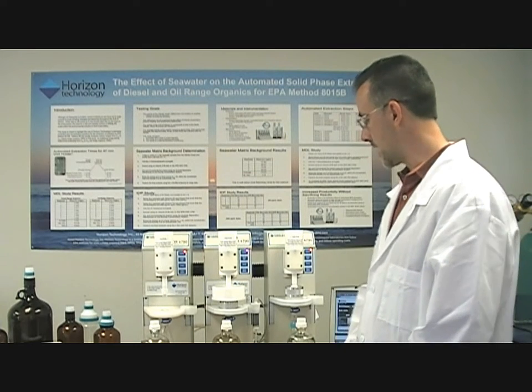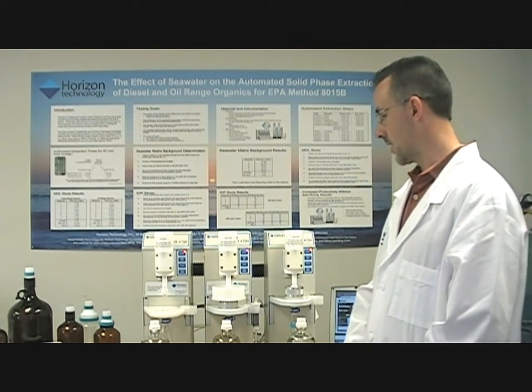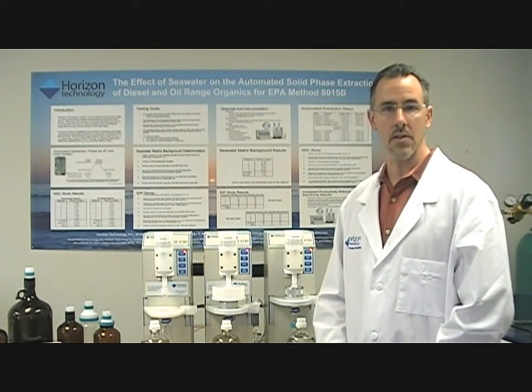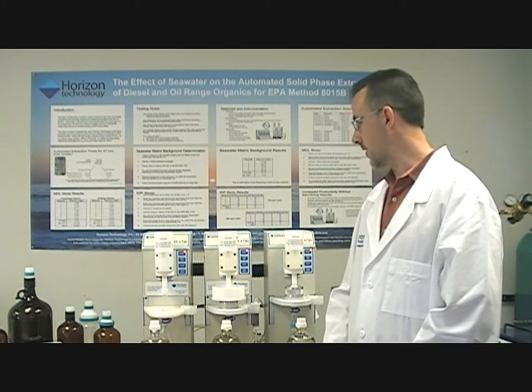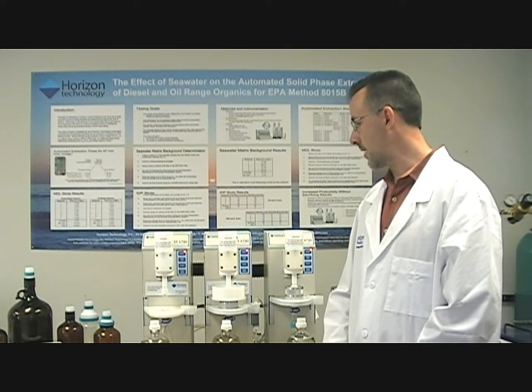It's used to analyze semi-volatile organic compounds from a variety of different water sources — surface water, river water, ground water, effluent — and it's typically, or historically, been a complicated method to automate.